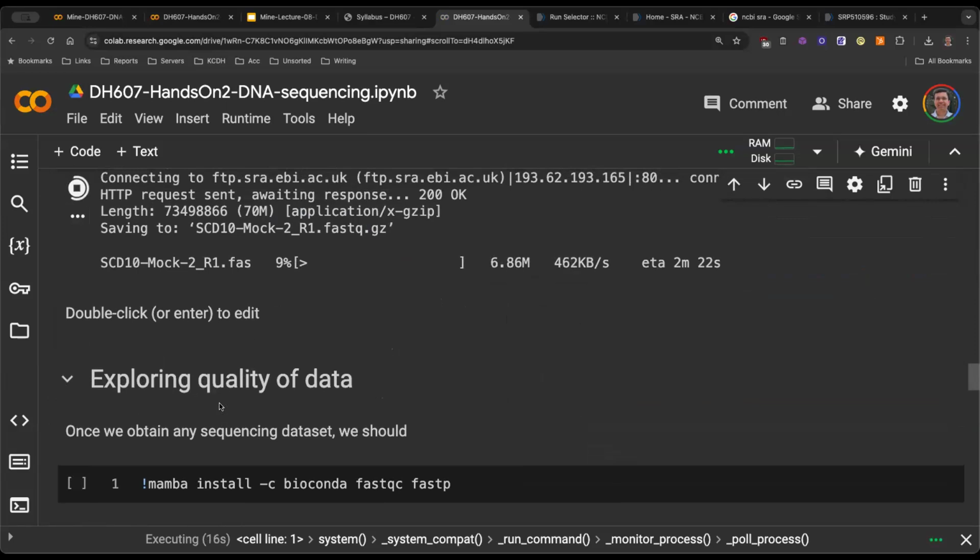What's the DNA insert? So the DNA insert is an insert. You had this genome to start with, right? The second step that you did is you sheared this apart. You introduce these random breaks. So these are your fragments.